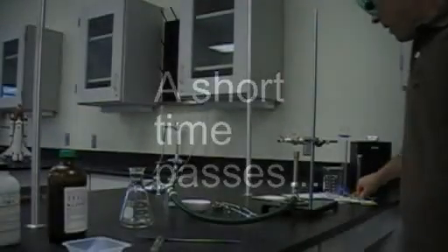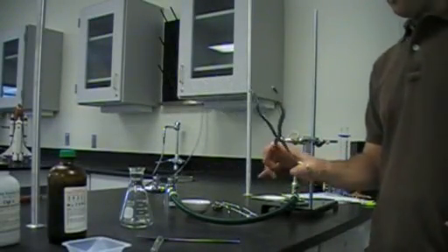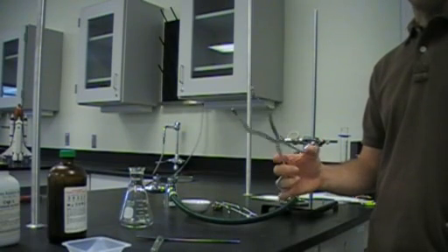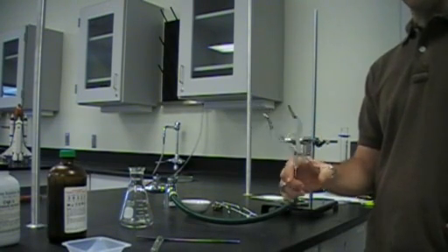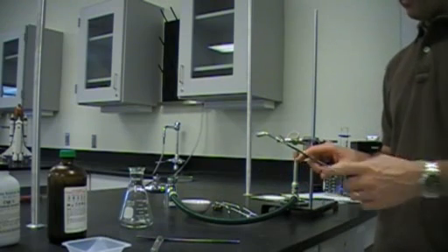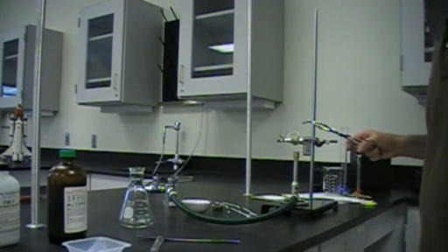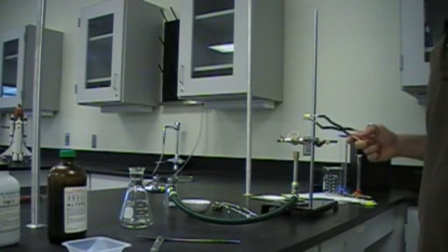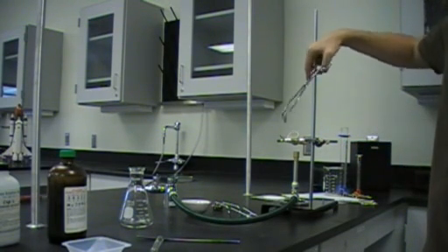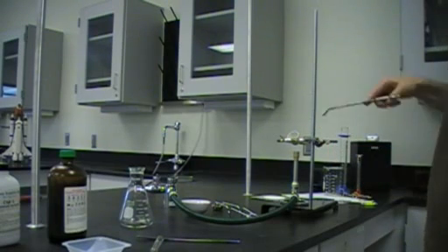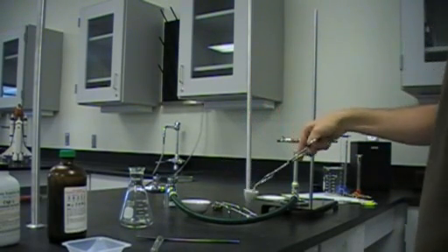All right, so welcome back. I have heated it. The reaction is completed. Another set of equipment is this. These are called crucible tongs. There are going to be several different tongs that we use in chemistry. These are crucible tongs. They kind of have a little end. It is kind of bent. It kind of looks like fingers. I am not going to want to touch ceramic that has been heated. Ceramic keeps heat fairly well. I won't use the scientific terms for it. But crucible tongs, just use these as an extension of your fingers.